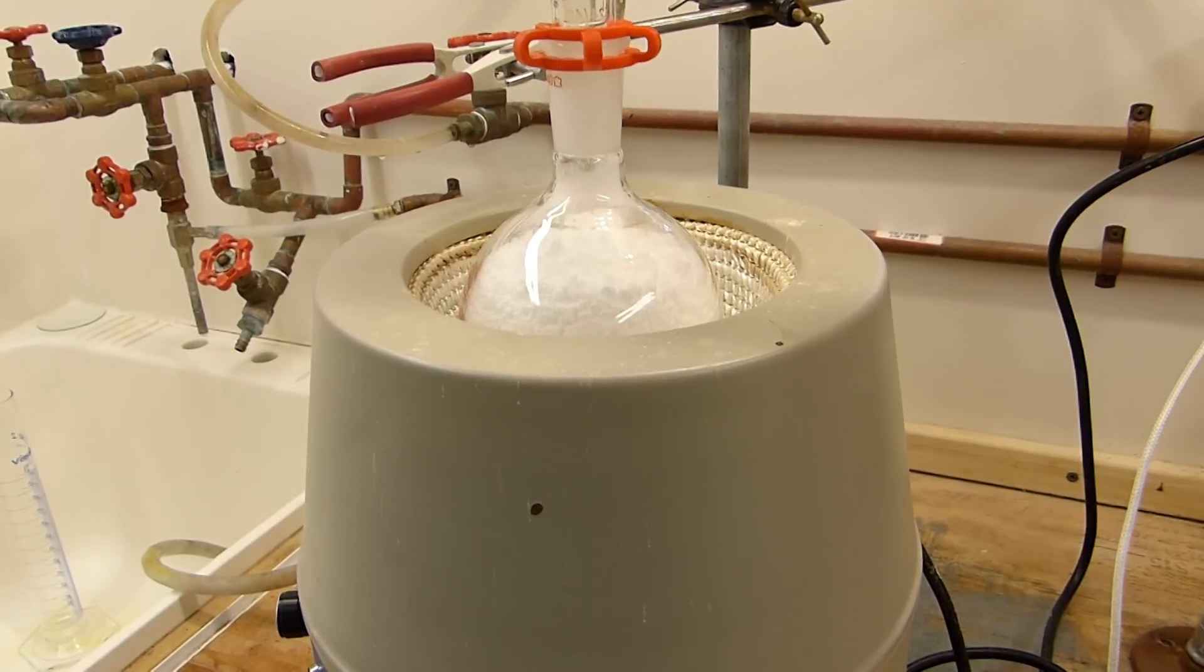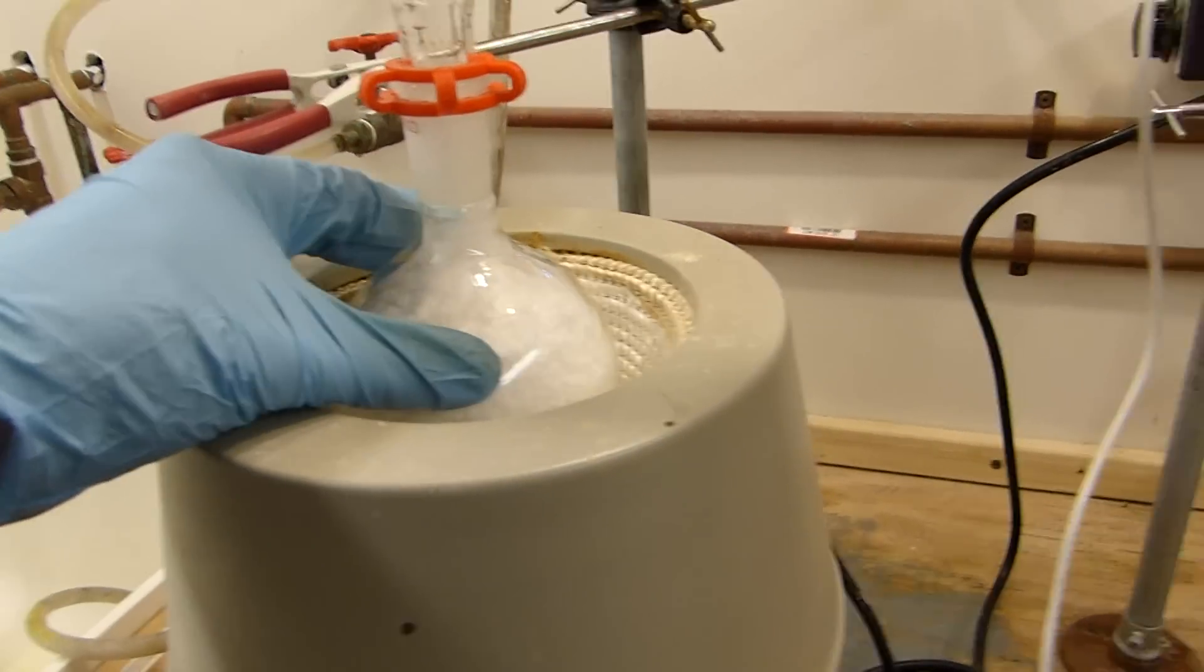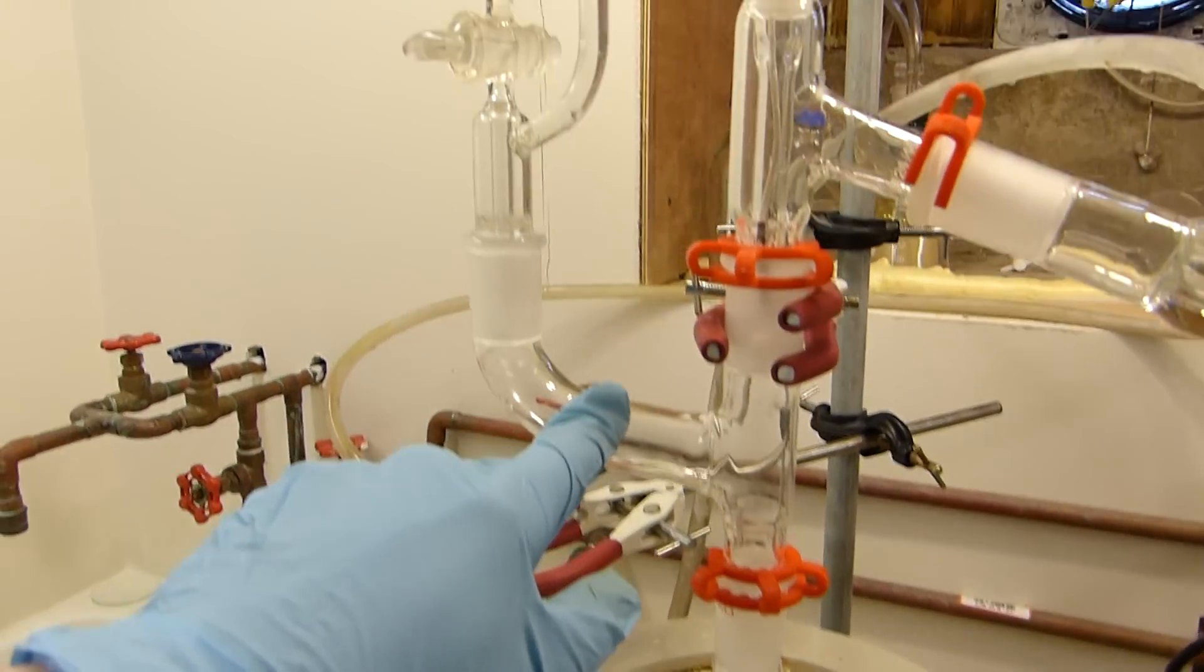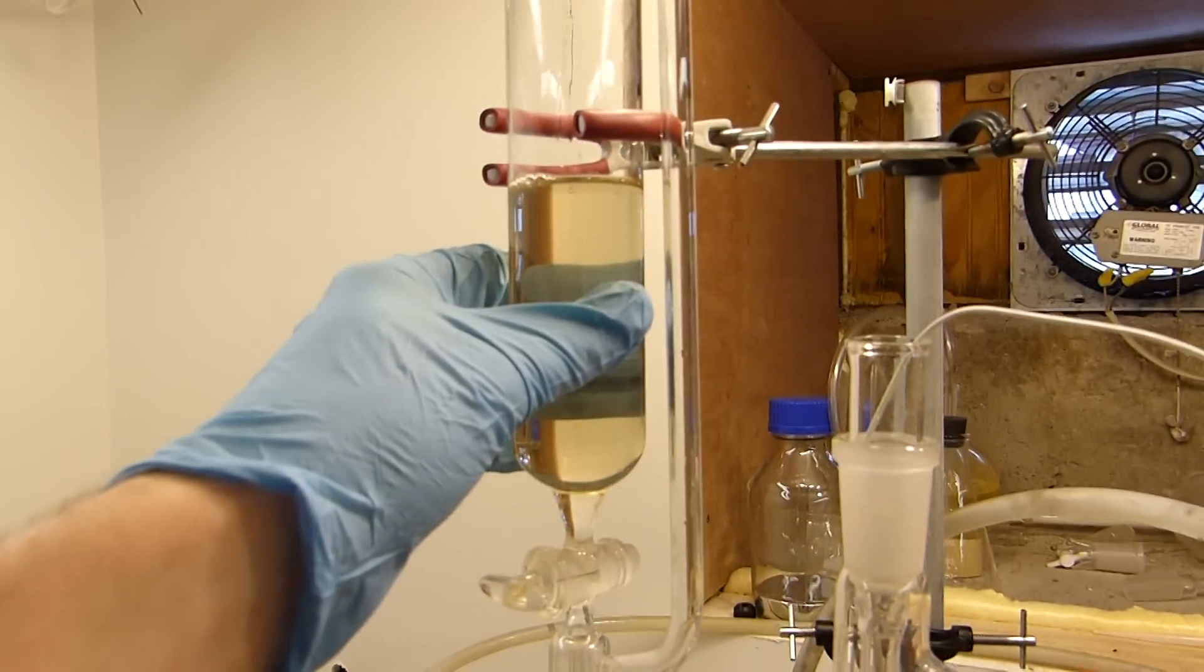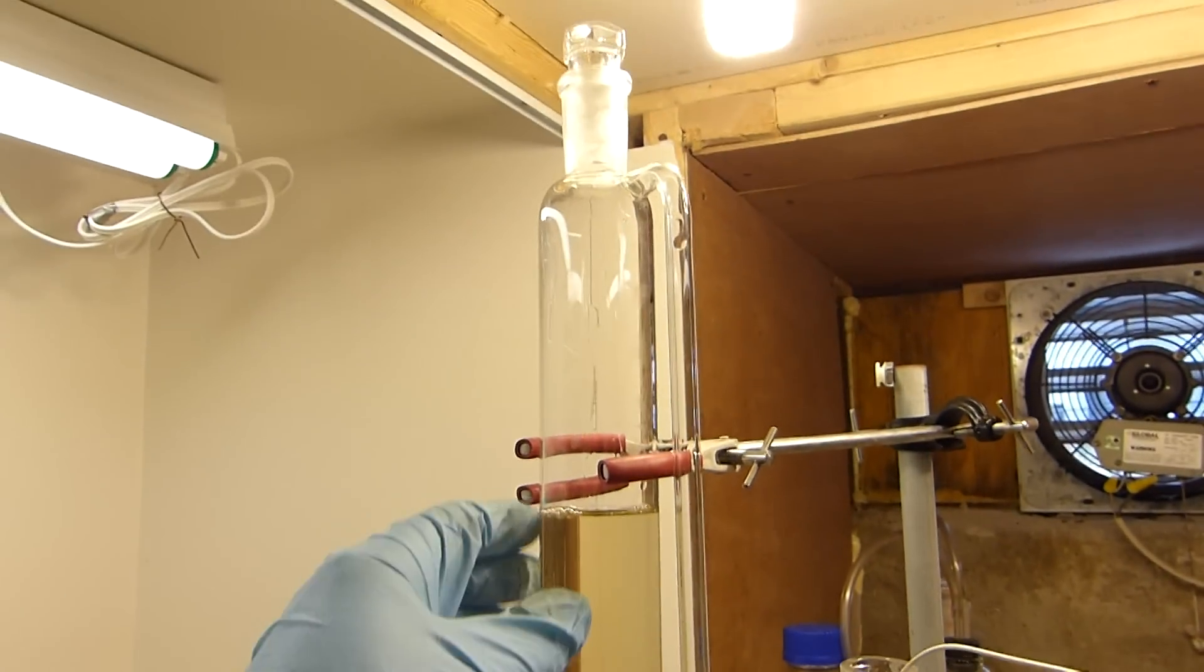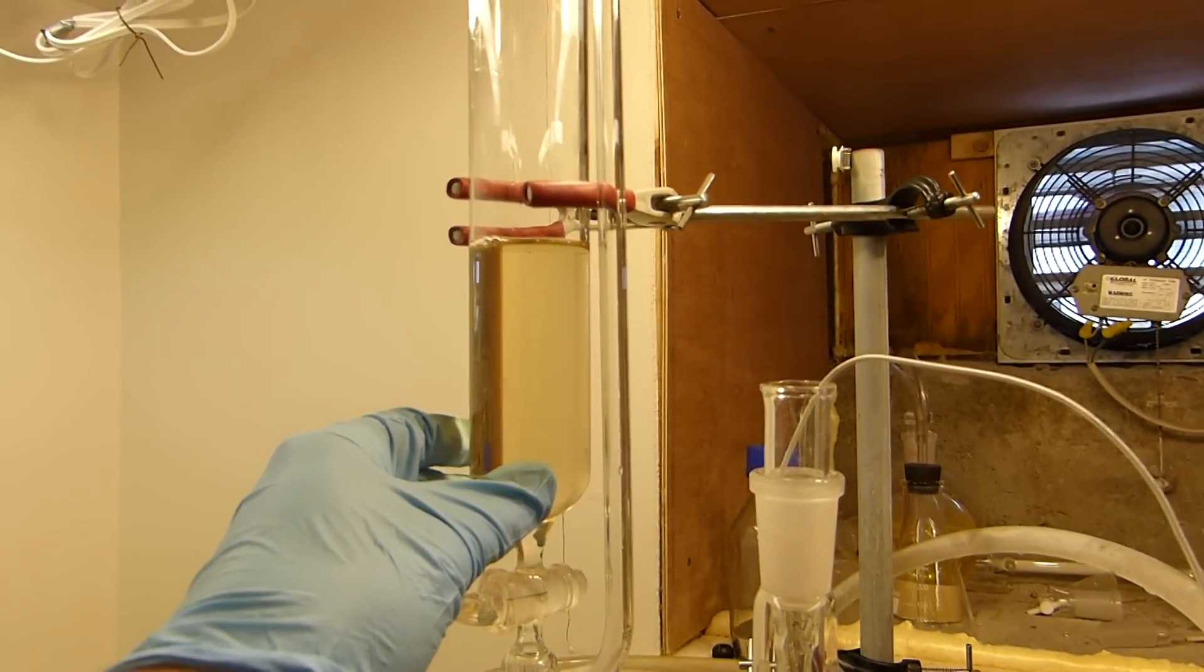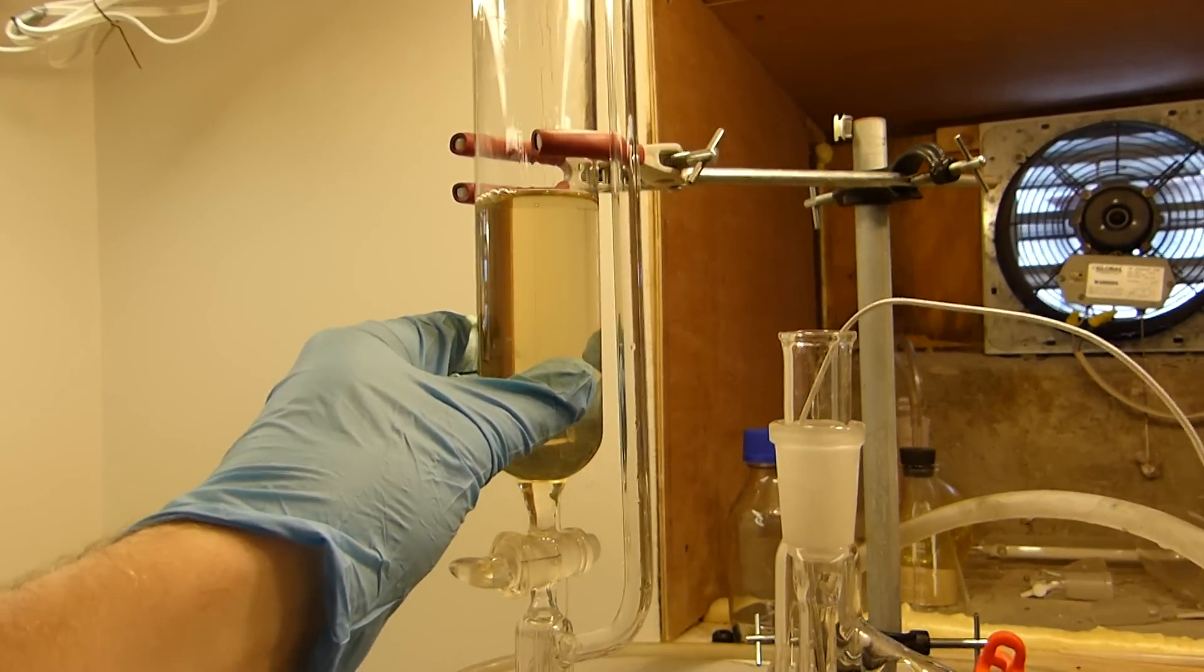The apparatus is now set up. I have the 500 milliliter round bottom flask with the anhydrous sodium acetate in it down here in a heating mantle. The claisen adapter on top of that, with in one arm a flask or an addition funnel of concentrated sulfuric acid.